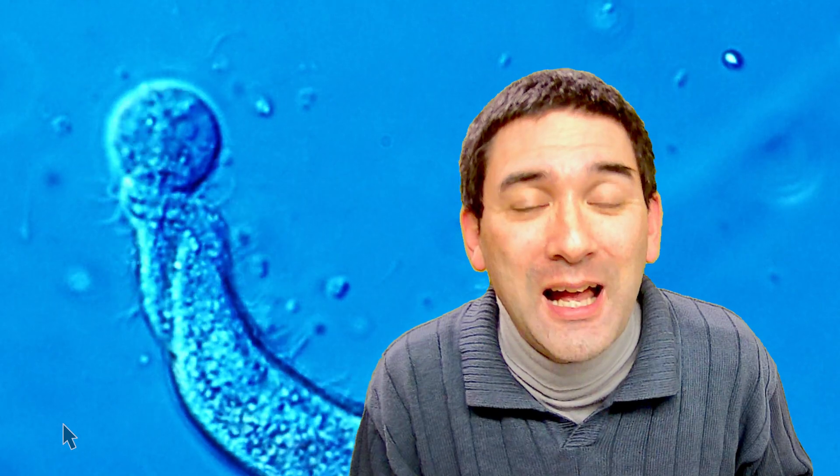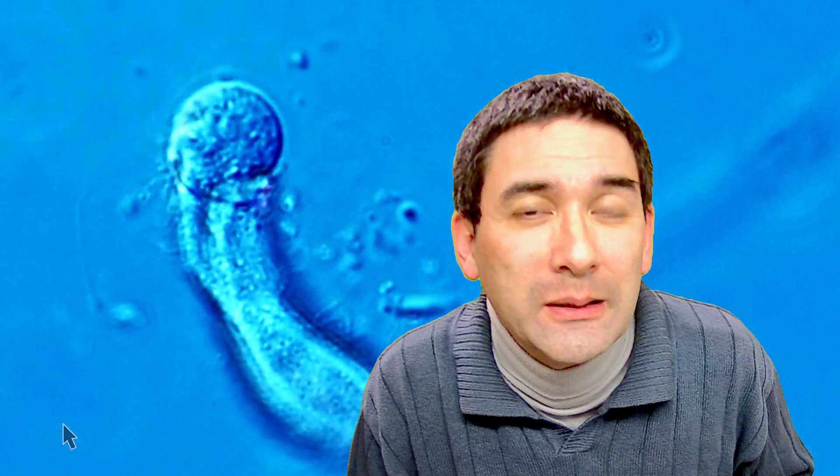Now in this sample I found probably a few hundred of those, so they felt fairly comfortable in there. We're just going to have another look at it now quite magnified. I zoomed in quite a bit and I also had to focus around a little bit here. Sometimes the cell is in focus, sometimes it's not, but you can also see the tiny little cilia — the tiny little hairs beating there — as it swallows up the much larger cell. Well, actually it's not significantly larger but at least significantly wider. And in the background here as well, also something I would like to show you, a little bit out of focus.